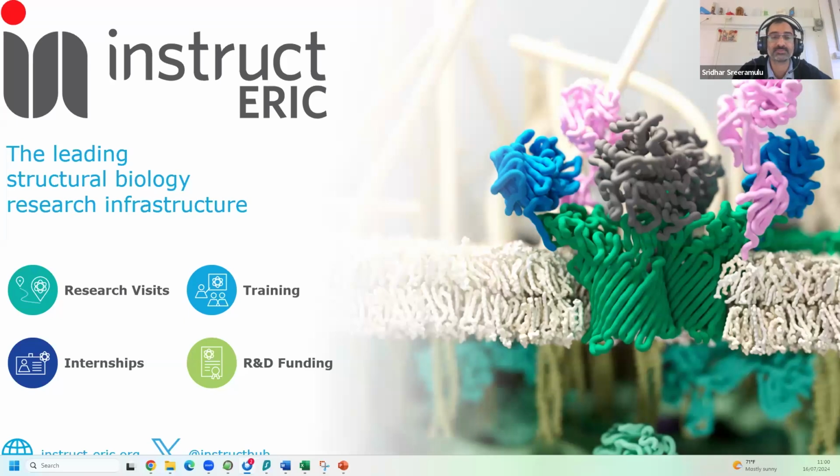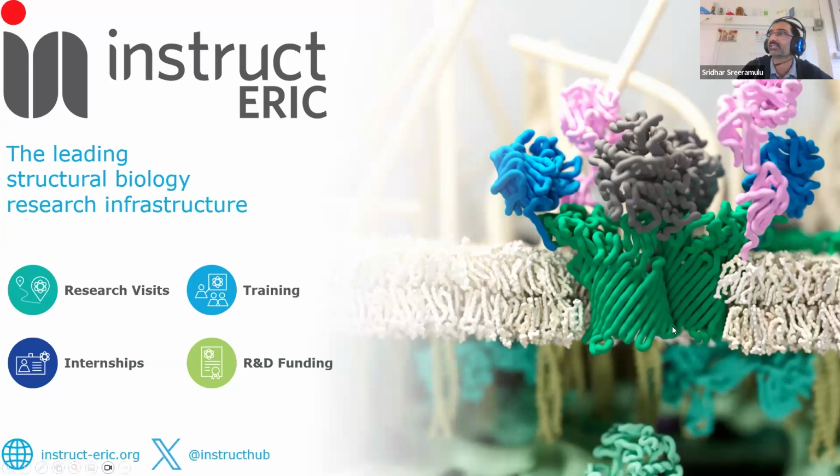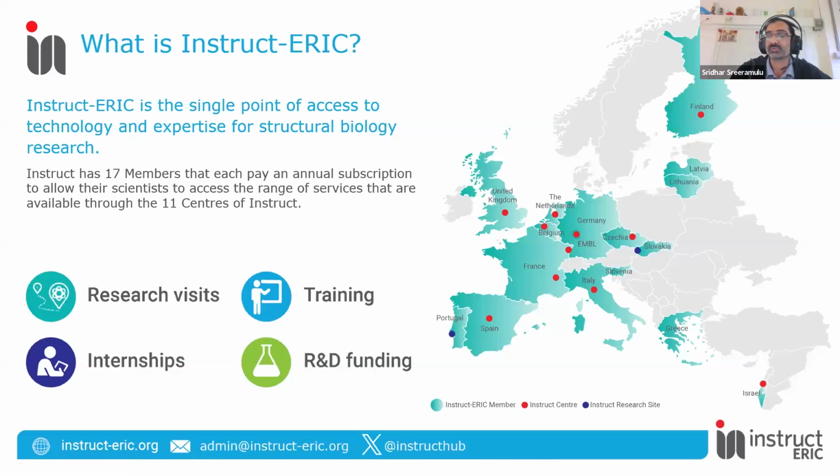My name is Sridhar, working at the Goethe University Frankfurt, mostly on fragment screening by NMR. Here today is Instruct-ERIC. It's the door to structural biology research infrastructure, where people can apply to various research facilities. This could involve research visits, training, internships, and R&D funding, which Instruct would also assist with.